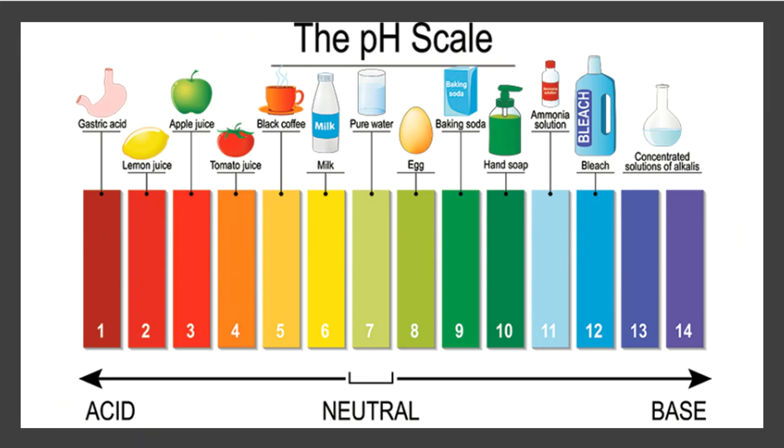So here's a pH scale, and the purpose of this lab is to basically take household solutions like you're seeing right here, maybe some of them, and just measure the pH of them, see what we get. That's all that this lab is really going to do. It gets you acquainted. It's your first date with the pH. So don't let us catch you in the corner making out with the pH probe. This is just the first date. You can do that a little bit later on your second or third date, but not on your first.